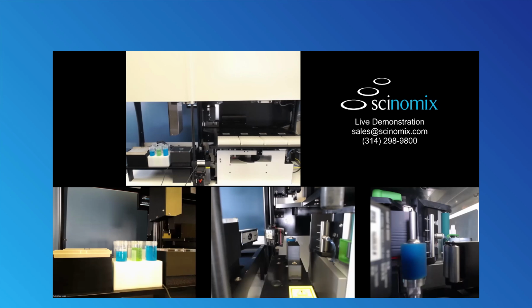Here in the middle is the roller position where tubes are being uncapped, labeled, and filled. This is where it's going to dispense that 750 microliters. Once it's done with that, it'll be recapped and labeled. And then on the far right side where this blue roller is, that's going to be that up-close shot of it actually dispensing the liquid into that position. And we call that position the primary exchange.